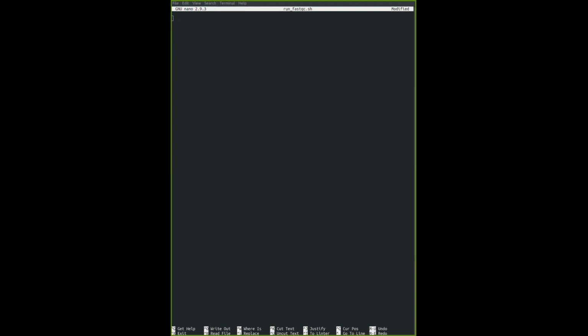And I'm going to copy the contents from Etherpad and paste. On Mac, you can do a simple Command V to paste into Nano. So I'm going to paste mine, and this is what you get after pasting into the shell script. Okay, you give it a try, Alexis, for a bit. The rest, everything's fine. Give me a thumbs up if you get the same output as me.